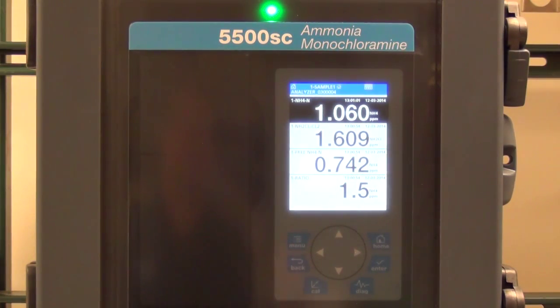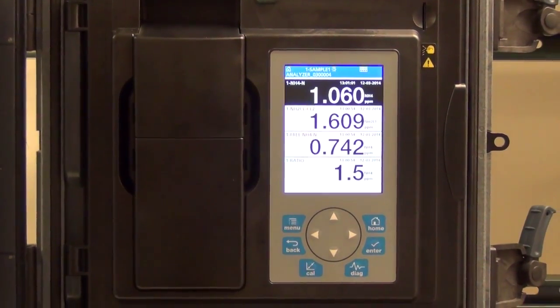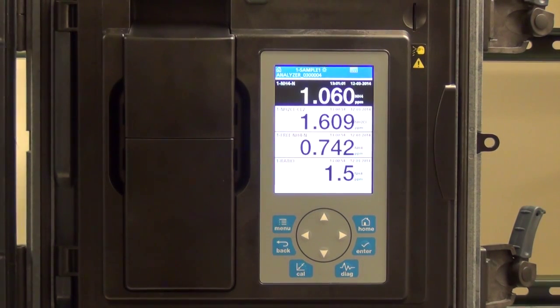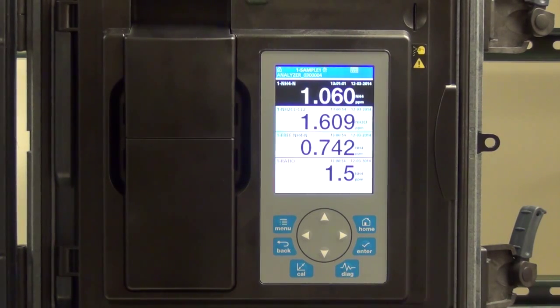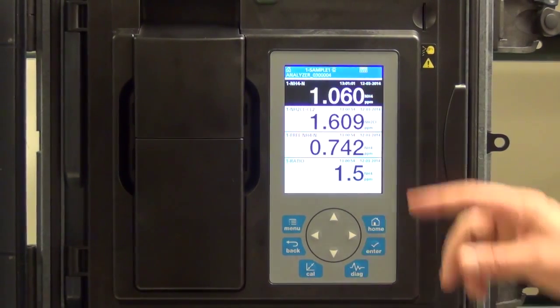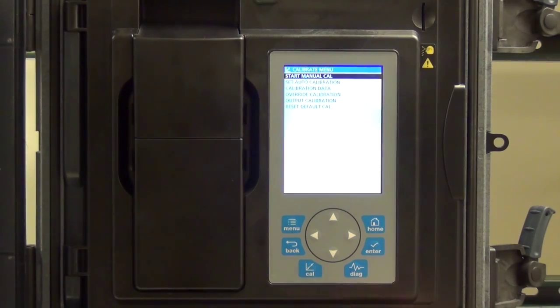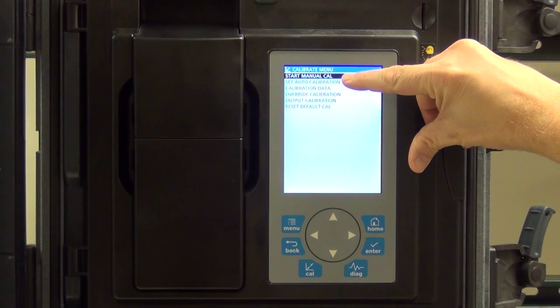The 5500 SC ammonia monochloramine analyzer is designed to easily keep itself accurate by automatic calibrations or manual calibrations using onboard standards that are housed in 2-liter jugs in the bottom compartment. To access the calibration menu, you press the hard key at the bottom and it gives us a bunch of different options. First and foremost, one can initiate or start a manual calibration by using the top choice.